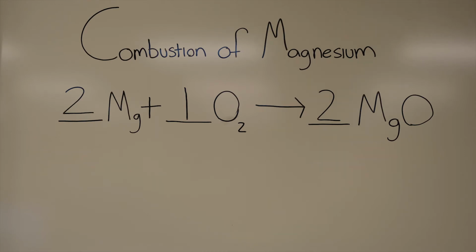The amount that you are going to work with today is 5 moles of magnesium. So my question to you is, if we start with 5 moles of magnesium, how much magnesium oxide are we going to produce? You will need to use your mole ratio and that balanced equation to figure that out. So really quick, let me show you what 5 moles of magnesium wire looks like.